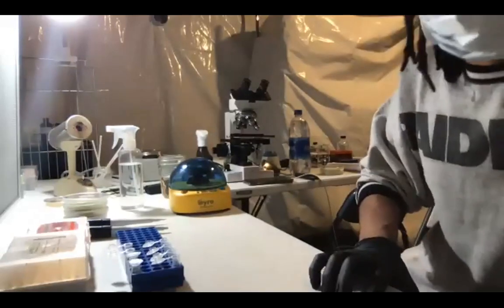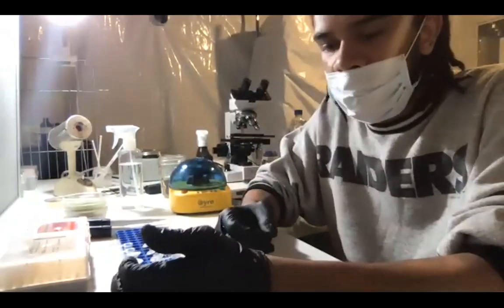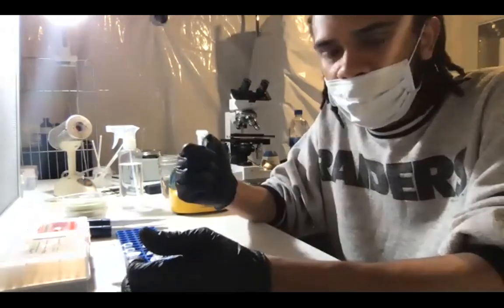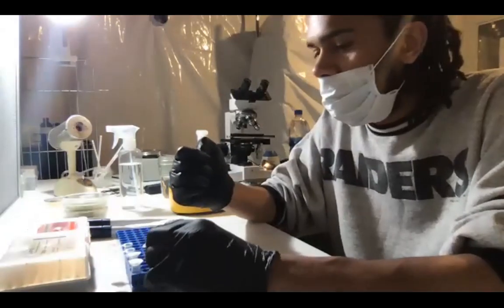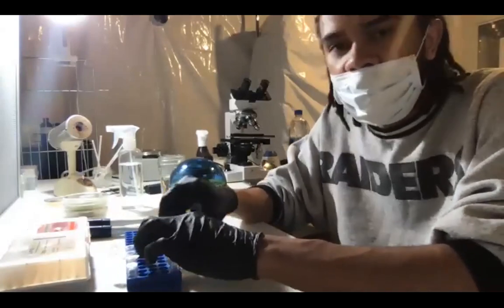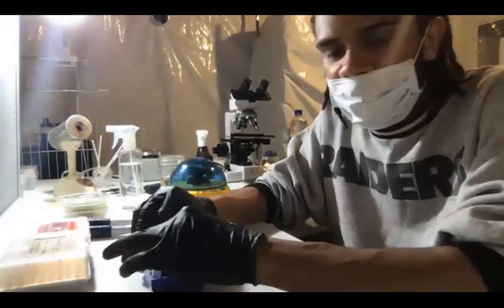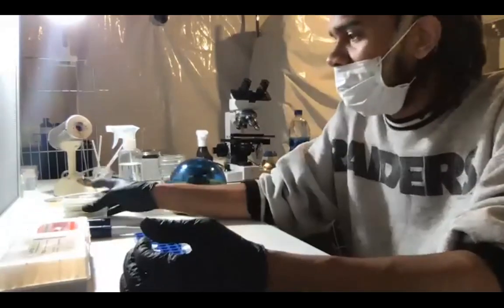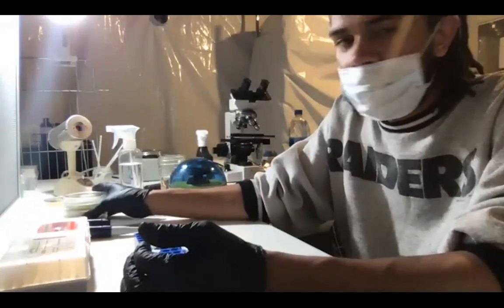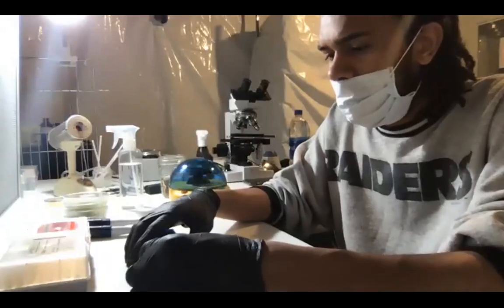I have to pull these spores out of a dish with a bunch of other spores in them. So occasionally they might have already connected before I pulled them out. That part requires a little bit of dexterity, and you have to do it under the microscope. So every now and then you'll make a mistake. But I'd say I have about a 90% success rate. It's not often that I mess up, but I did leave these a little bit longer than I usually would. So there is more potential that these already mated.